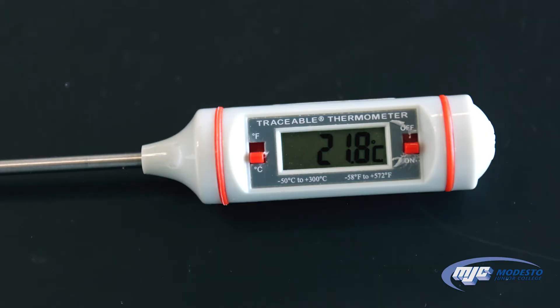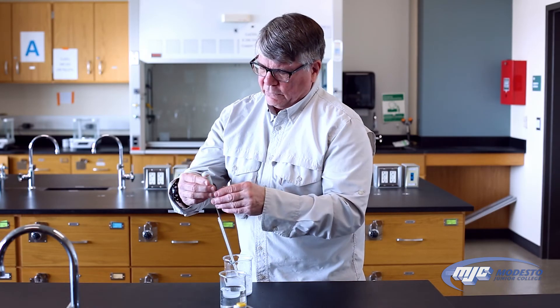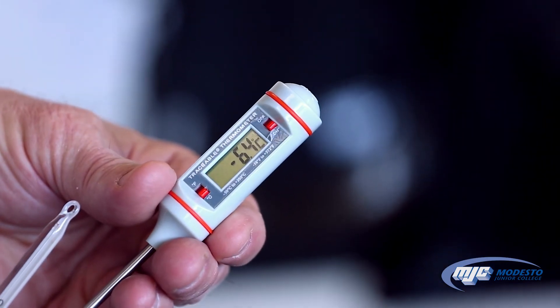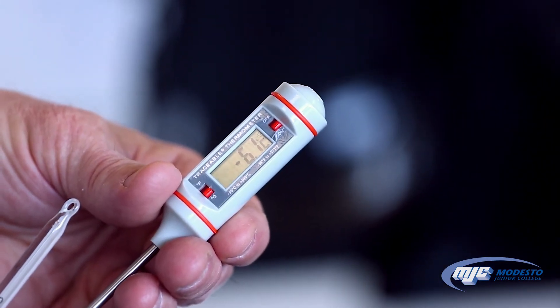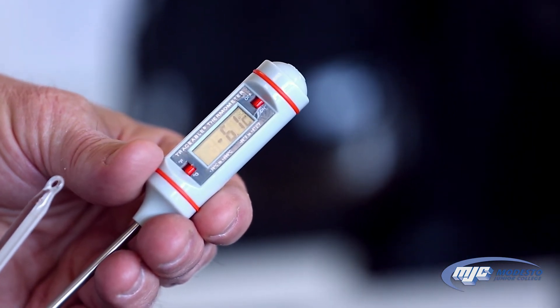With the digital thermometer, when you turn it on there are two switches. Make sure the one on the left is down on the degrees Celsius reading, not degrees Fahrenheit — we never use degrees Fahrenheit here. The right switch up is off; if we flick it down, then it comes on. We put this into our container and read it. It's changing — negative 6.1 — so you want to let it settle down.